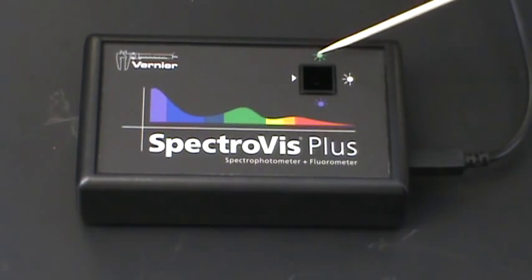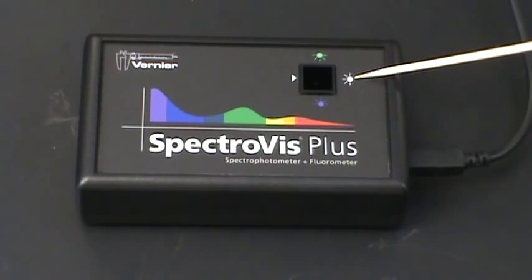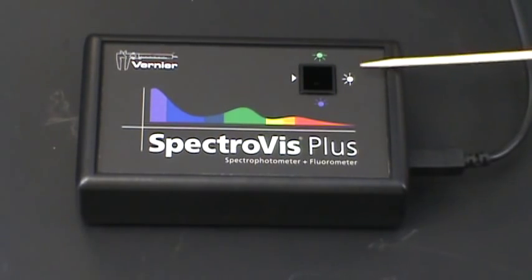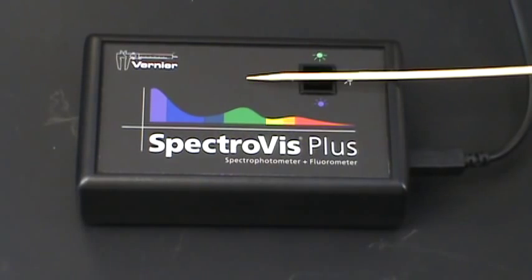All we're going to be doing at this point is white light spectroscopy, so spectrophotometry. So here's the white light. The white light is going to come in from this direction. It's going to shine through our sample and go into the detector.